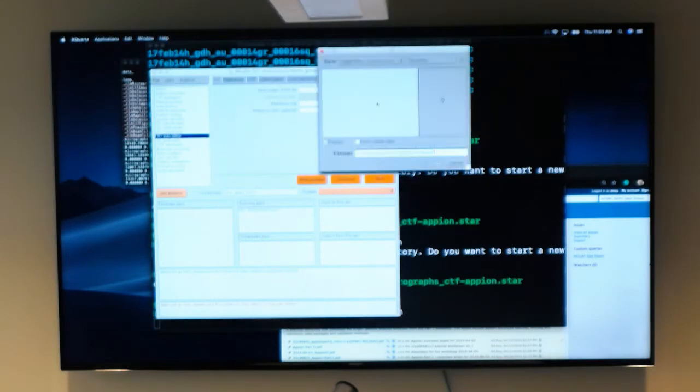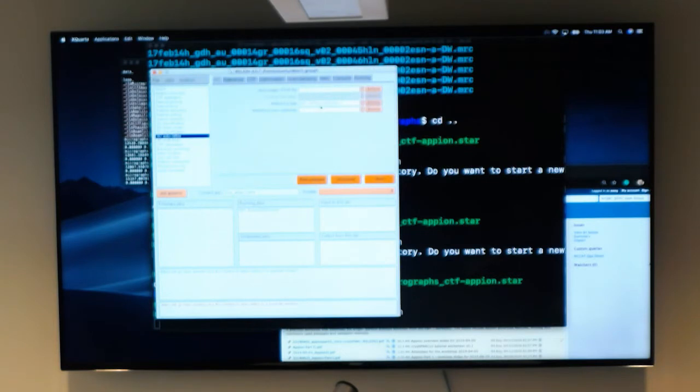So again, by default, it hops into a known structure, but you know where you keep your files. In case it tries to, for ease of use, hop into an alias that was generated within Relion. But since we preceded your folder with certain files already, you would have to explicitly go to that file path and find something. For example, if I want to do 3D refinement, and I extracted my particles at 144 pixel size, I would use this reference model.